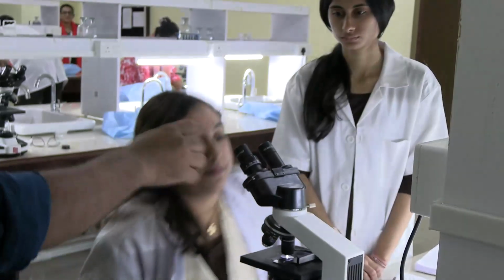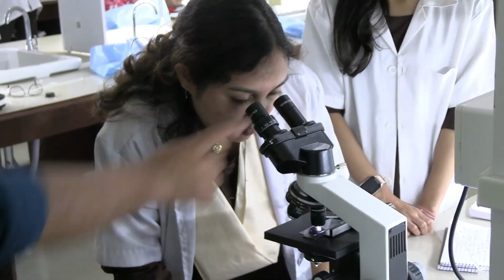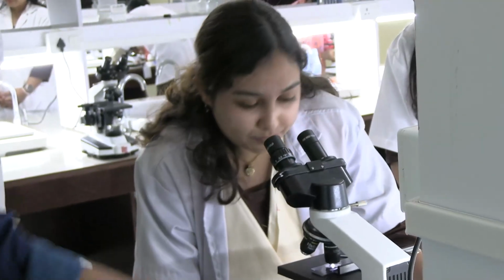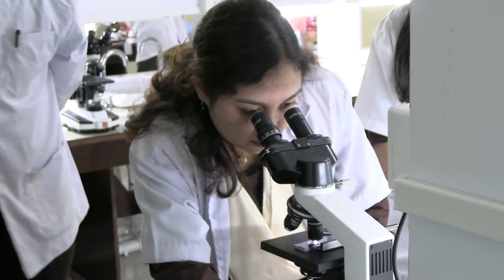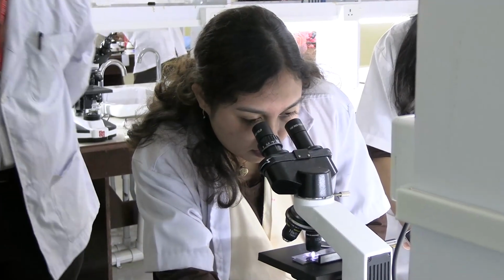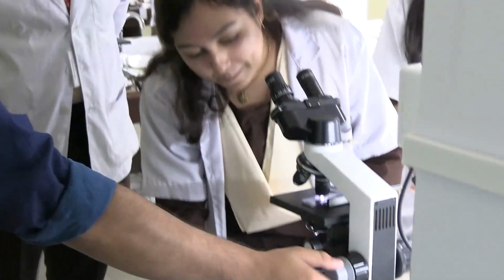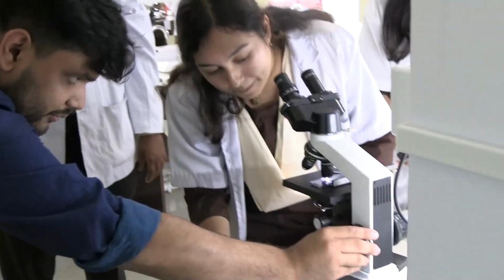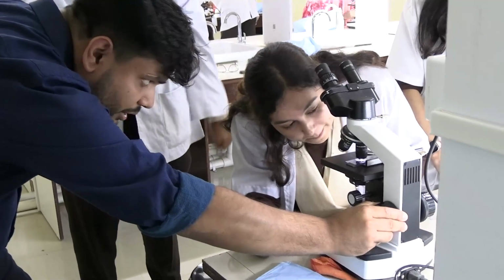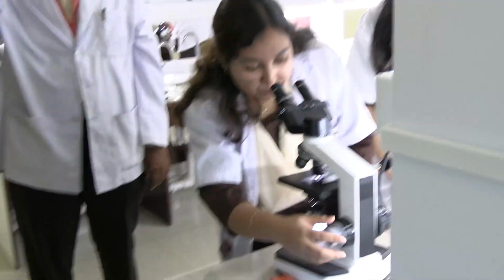Now we can watch through the eyepiece. Use the right eyepiece because the left one has a lot of artifacts. Use the right one. And you're gonna hold the fine adjustment and rotate it anti-clockwise towards you. No, this is a coarse adjustment. Anti-clockwise. This is the clockwise. Remember, listen, this is the clockwise, this is the anti-clockwise. Once you have fixed the smear and you have raised the mechanical stage up to a point where there is some resistance, you're just going to use the anti-clockwise motion to find the bacteria. Okay?